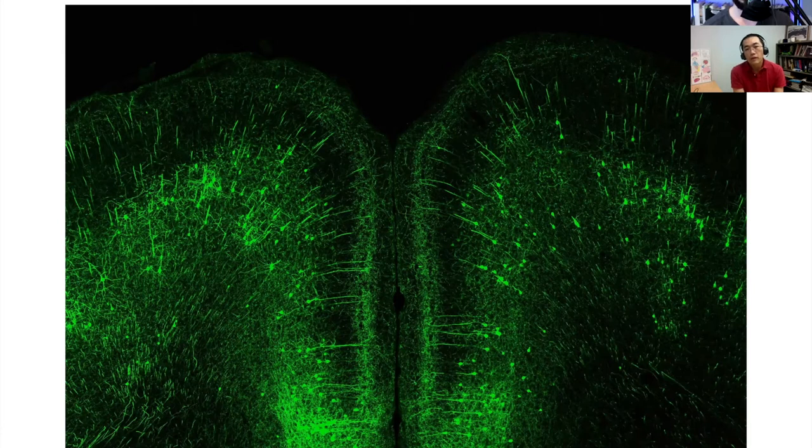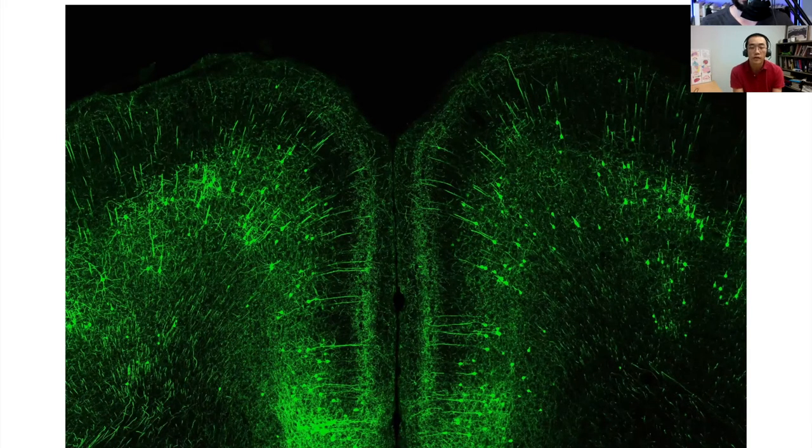And this is not a normal mouse. This is a transgenic mouse, so this mouse is engineered to have a fluorescent protein already expressing in some of its brain cells. So that's what you are seeing in green. You can see here this is the frontal cortex of the mouse, which is where we do most of our studies. And what you can see is the small green circles, and those green circles are the cell bodies.